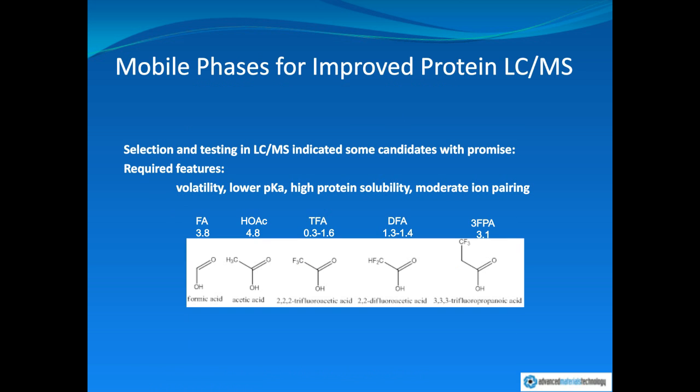As we started looking more closely at what conditions were tolerable in terms of work that we were doing in the lab, and many people do in the lab, we use a combination of not just UV detector, but also mass spectral detector and other detectors. But mass spec is particularly important for us because as we get to increasingly complex and high molecular weight samples, we just have to have mass spec in order to sort out what it is that we're doing in terms of protein structure and function and variance.